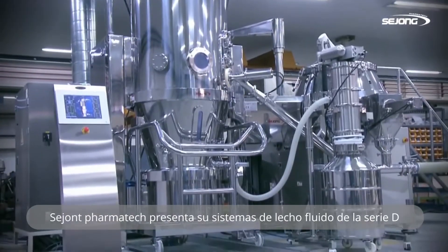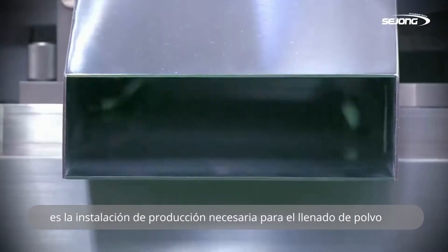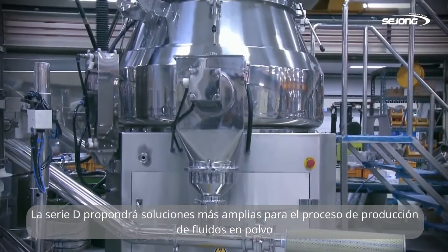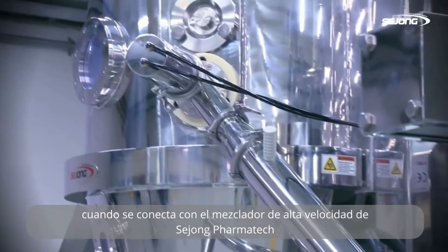Sejong Pharmatech newly presents the Fluid Bed System, D-Series. It is the necessary production facility for powder fluid. D-Series will suggest wider solutions to powder fluid production when it is linked to the high-speed mixer of Sejong Pharmatech.